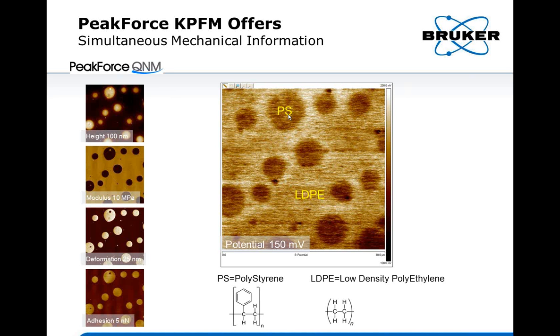It tells you, for example, that the polystyrene part has a smaller work function than the low-density polyethylene. So that's one advantage of PeakForce KPFM versus Tapping mode, where Tapping mode, of course, gives you a phase contrast, which doesn't give you a quantitative number on whether that's from the modulus difference or the adhesion difference, those kinds of information.